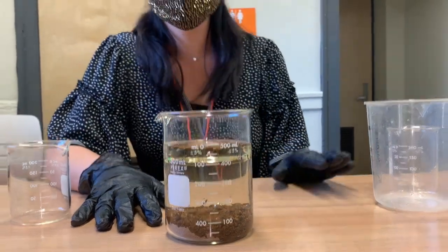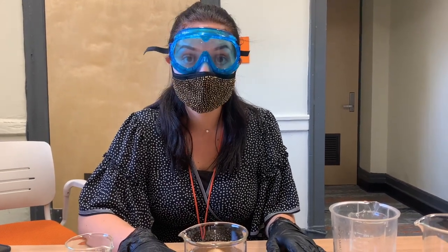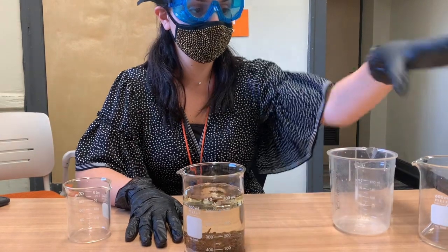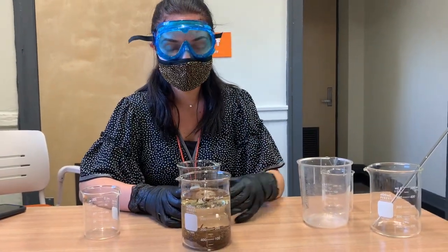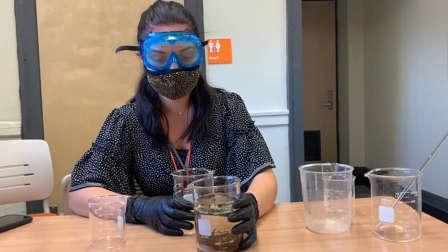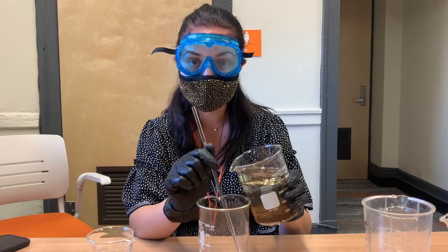So now what we're going to do is we're going to start the decantation process. Now that they're all in the same beaker, we're going to try to separate them from each other. First, we're going to separate the oil from the water. So we're going to be using this glass rod to help pour our oil into the beaker.